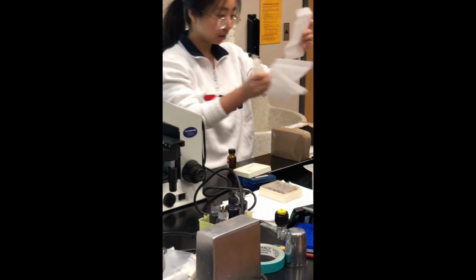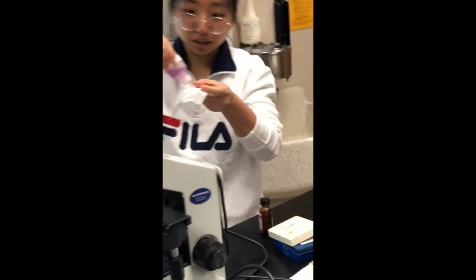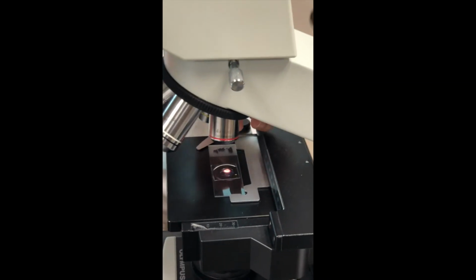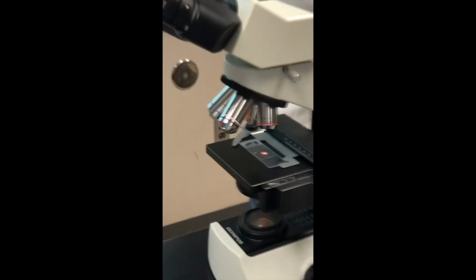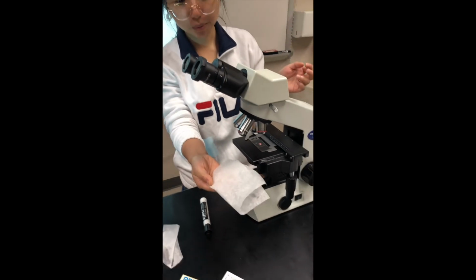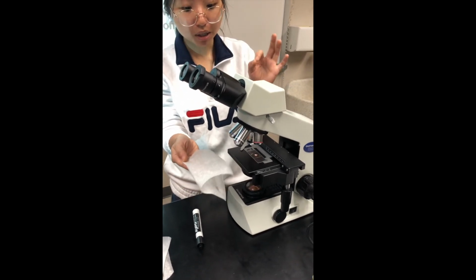Lens paper is different from our Kim wipe or paper towel. So you get some cleaning solution and take our 100 times. Clean it because it touched the oil. After you finish cleaning it, you want to check. Use another clean lens paper to double confirm that there is no oil anymore. That's good. You get a clean compound microscope.